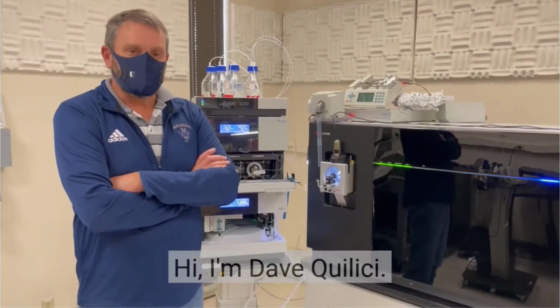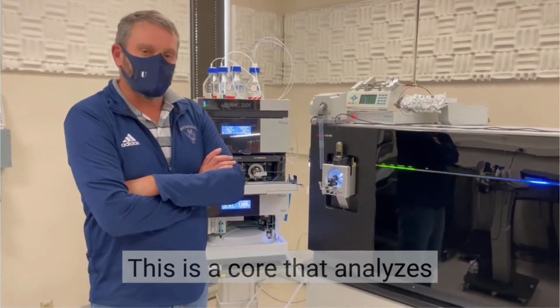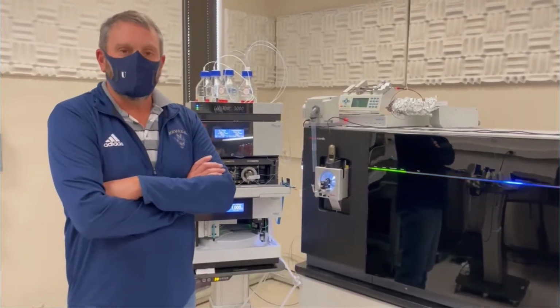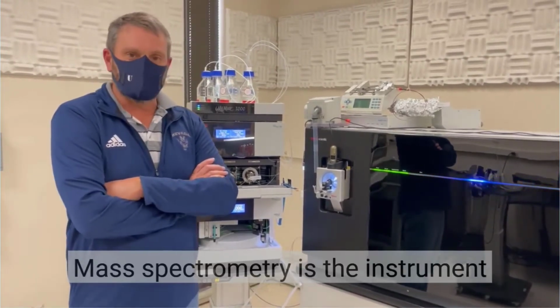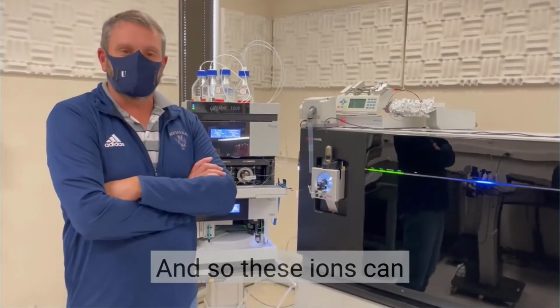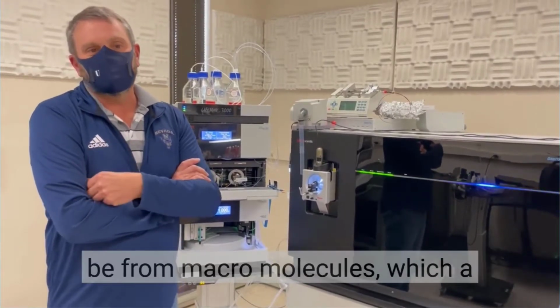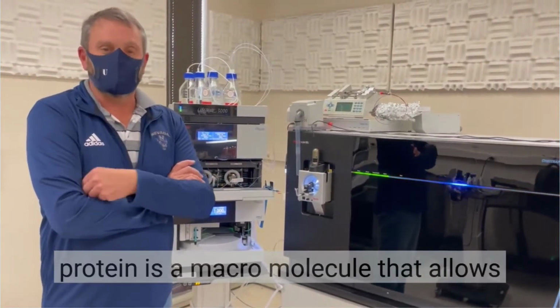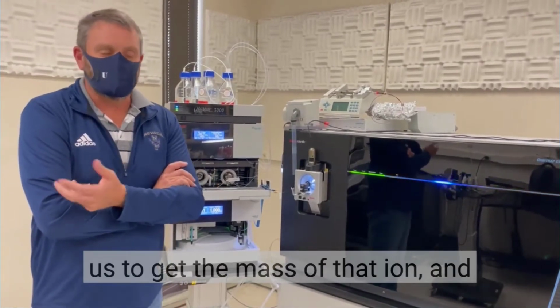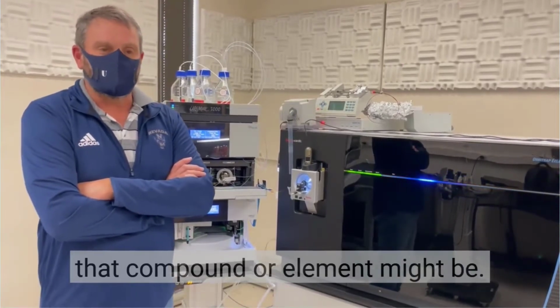Hi, I'm Dave Quilici. I'm the director of the Nevada Proteomics Center. This is a core that analyzes protein using mass spectrometry. Mass spectrometry is the instrument that analyzes and measures ions. These ions can be from elements, molecules, or macromolecules, of which a protein is one. It allows us to get the mass of that ion and then determine the structure or what that compound or element might be.